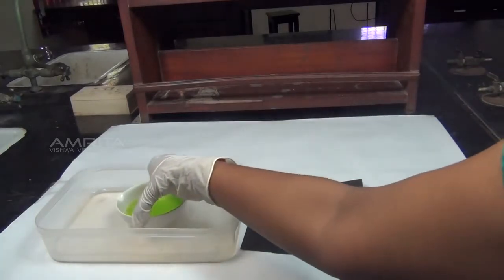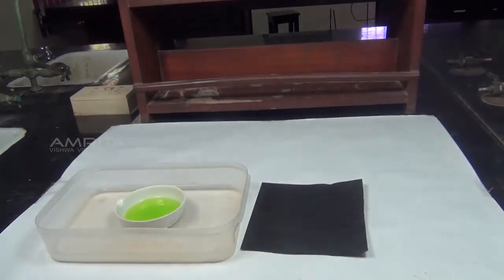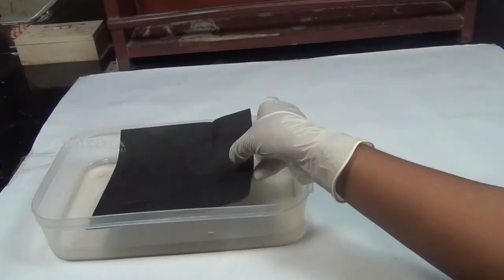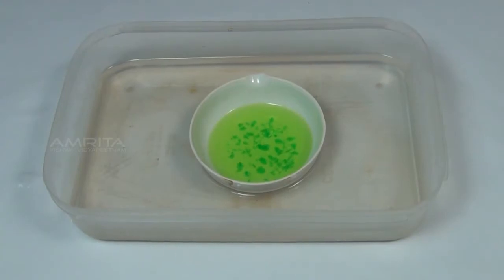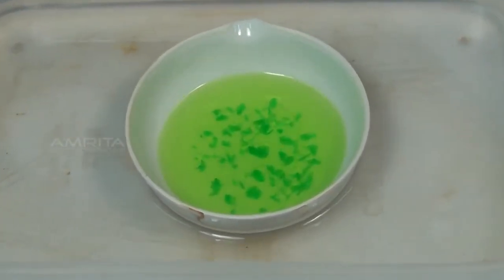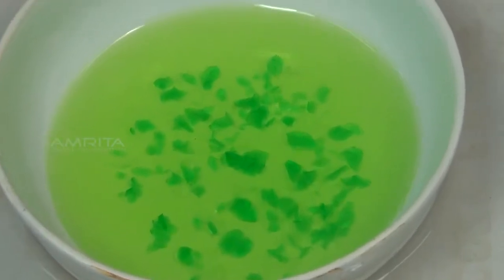Now place the china dish in a trough containing cold water. Cover the dish with a black paper and allow it to cool slowly for some time. On cooling, emerald green crystals of potassium trioxalatoferrate separate out.